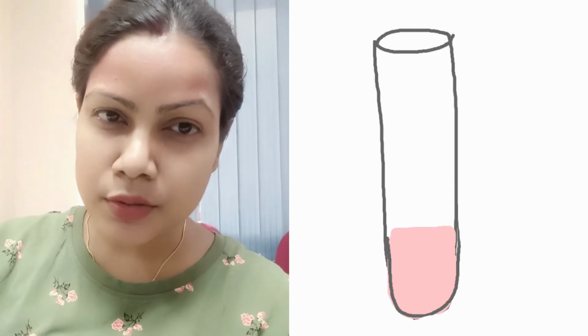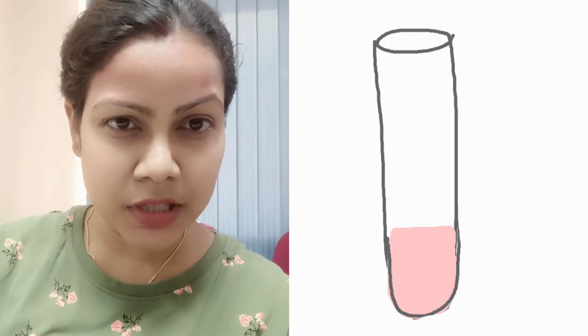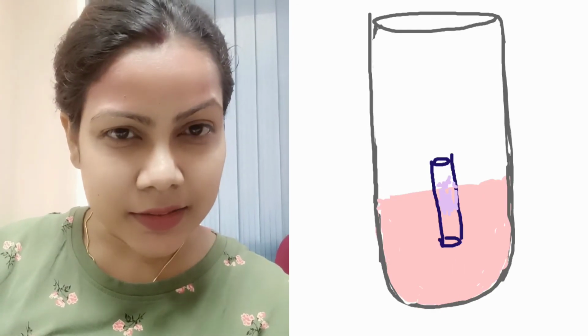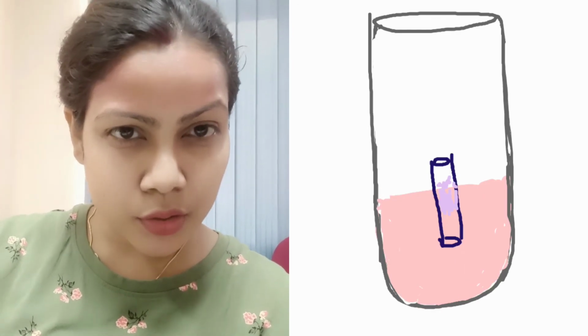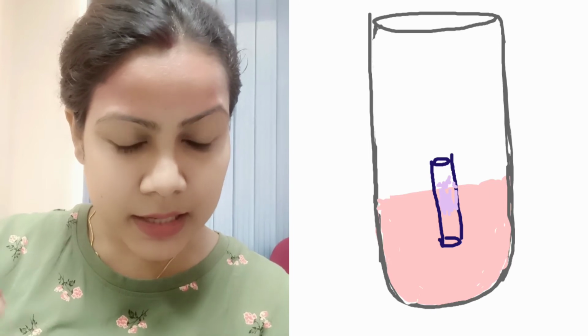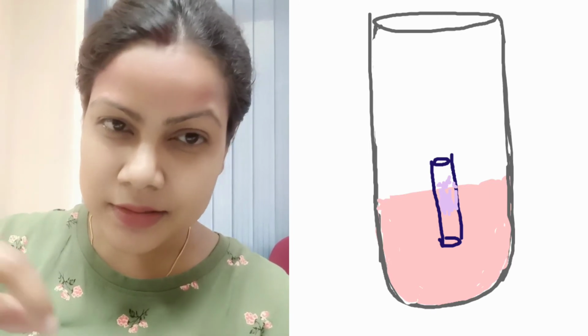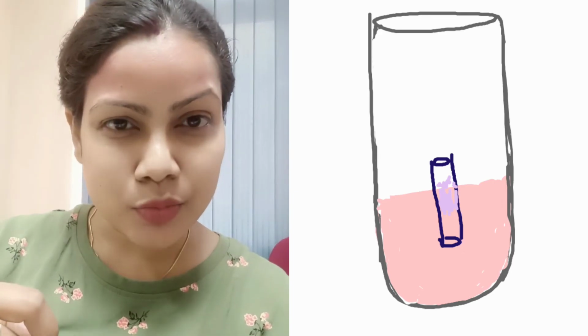We also need a bigger test tube having semi-solid culture media, and then we place this small hollow tube, also called the Craigie tube. That's why this method is named the Craigie tube method.